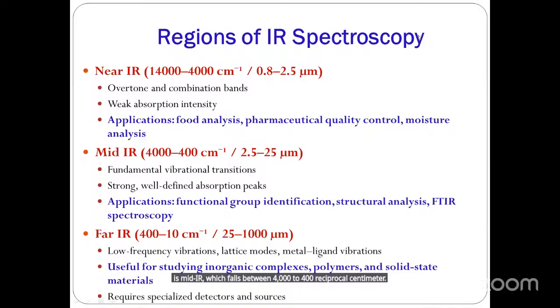And this region is very, very important for the identification of functional groups, structural analysis, and this gives us FTIR spectroscopy.